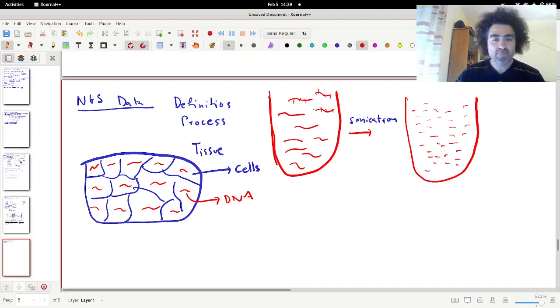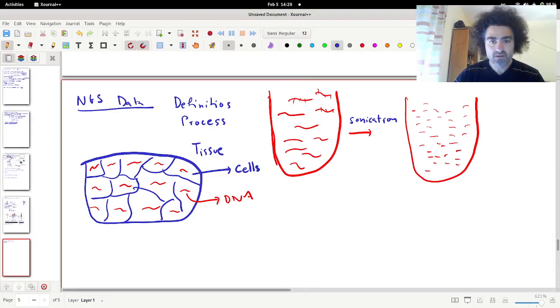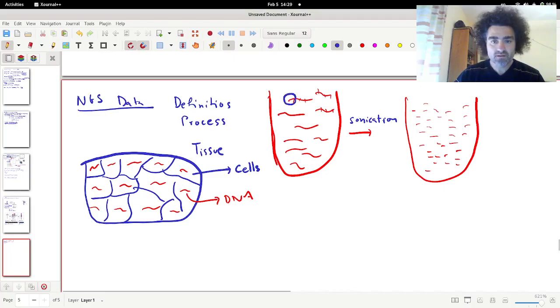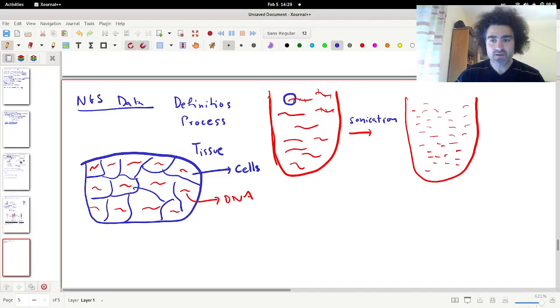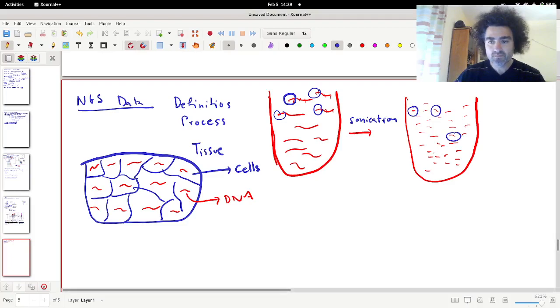Okay, now what is important to understand at first step here is that this piece of DNA, you actually have it here multiple times, because you have it from this molecule, and from this molecule, and from this molecule, and so on. So let's say that these are these pieces of DNA here. They should be exactly the same. Well, no, part of it should be exactly the same.